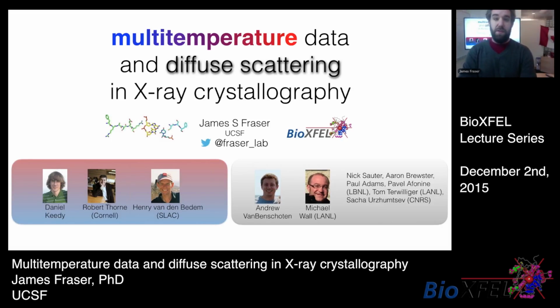And then some of the work that we've been getting out of the temperature data has really raised some interesting problems in how to model correlated or coupled motions in proteins. And some of the experimental data that's recorded during X-ray experiments in the form of diffuse scattering can, we hope, in the long term be used to improve the modeling of these multiple conformations. And so for the last several years, we've been collaborating with Mike Wall, as well as a whole cast of characters from LBL and Los Alamos, and as well in France. And Andrew Van Benschoten, a former graduate student in my lab, who's now a data scientist at Oracle, has led that effort. So I'll talk about that at the end.